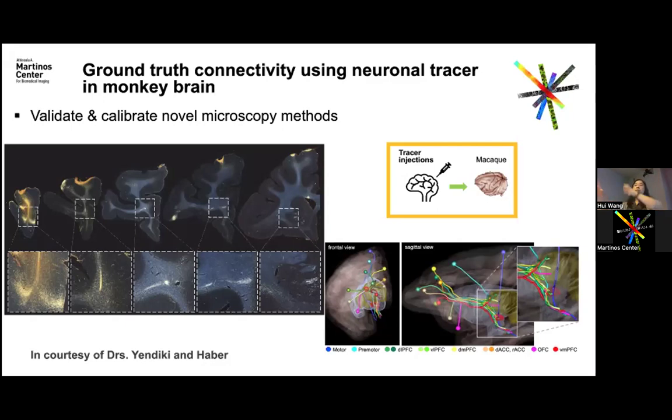That part is a very nice pipeline we just published last year, but there's still an issue: once the slices are cut off and mounted on glass slides, there are enormous distortions. You have to do a nonlinear registration between the PSOCT image and the histology images. We have very good preliminary results, but if we want to do a voxel-wise comparison for the fiber tracks at say 3 microns, that's still pretty challenging. So what can we do better?